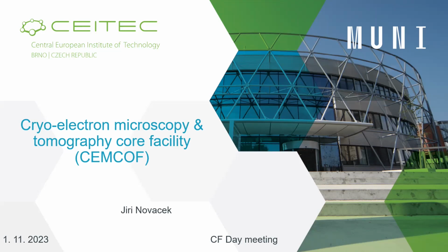For instance, it is complementary for cases where you can't crystallize your protein, or where your crystals are small, because apart from being an imaging technique, we can use the electron microscope to obtain inverse space diffraction images. And we can also use the electron microscope as an analytical tool to study the composition of matter, which is primarily used in chemical research, not so much in the life sciences.